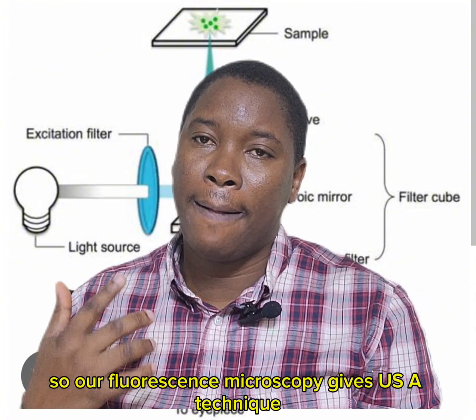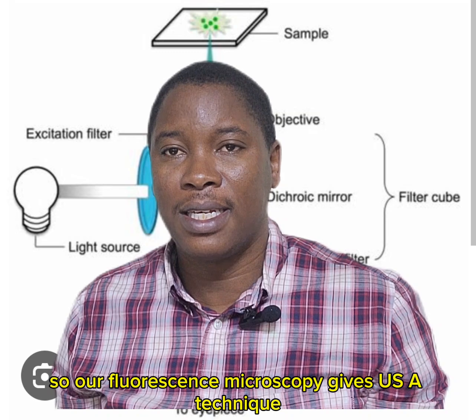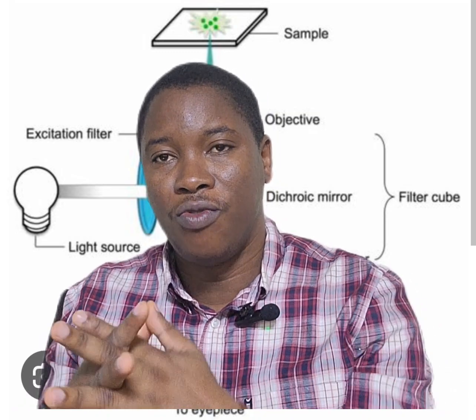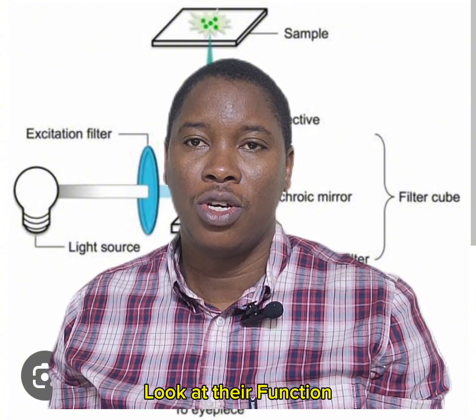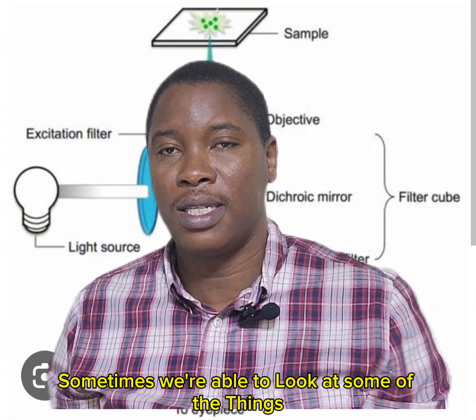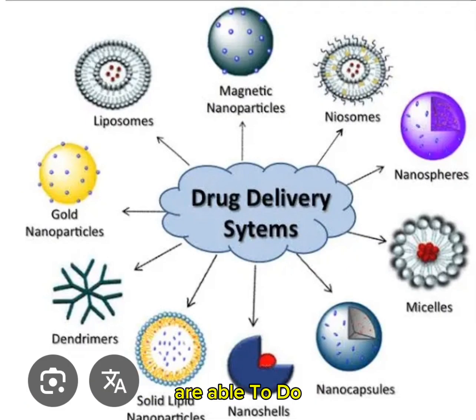Fluorescence microscopy gives us a technique that helps us view these organelles really well, look at their shape, their function, and sometimes some of the things that these organelles are able to do.